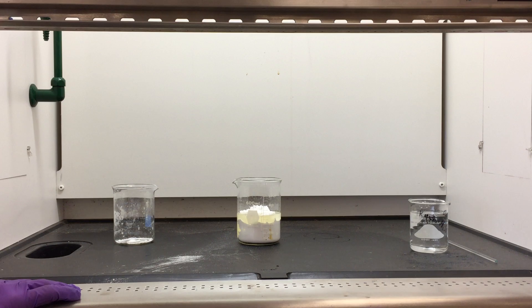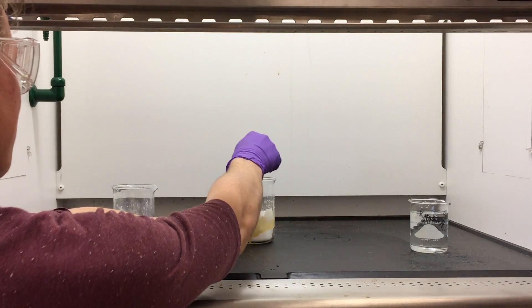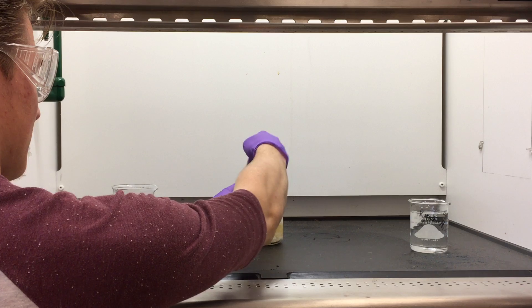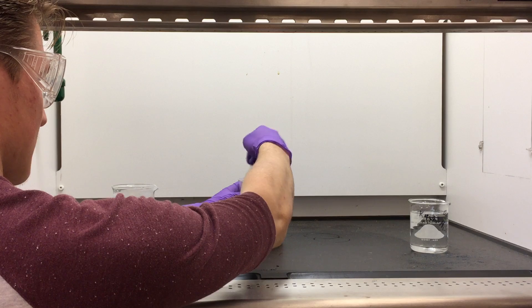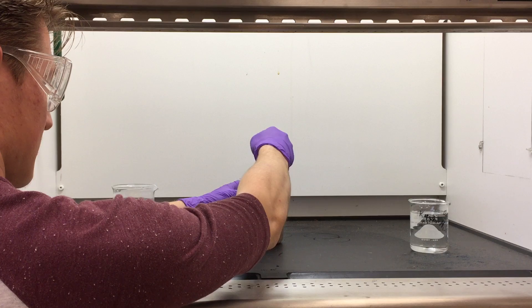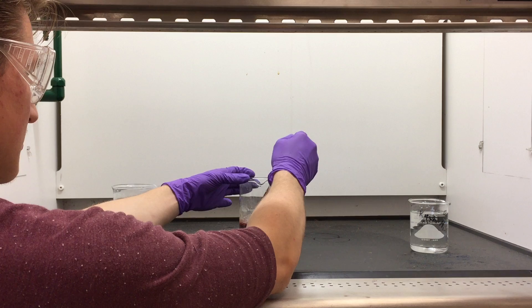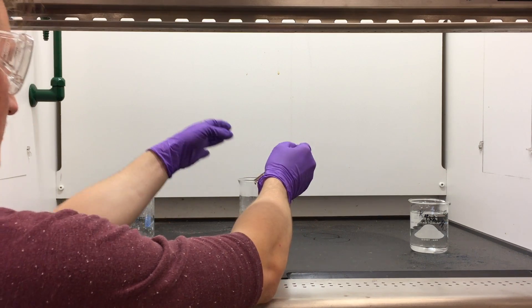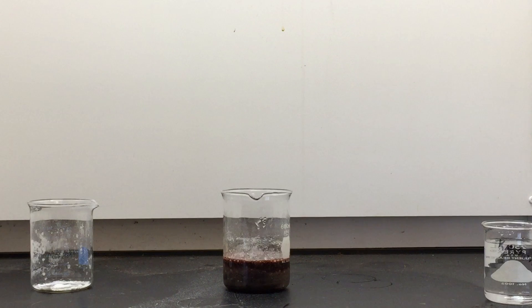Once done, we take the glass stirring rod and mix it together. Once this is done, you can just sit back and watch as the reaction occurs.